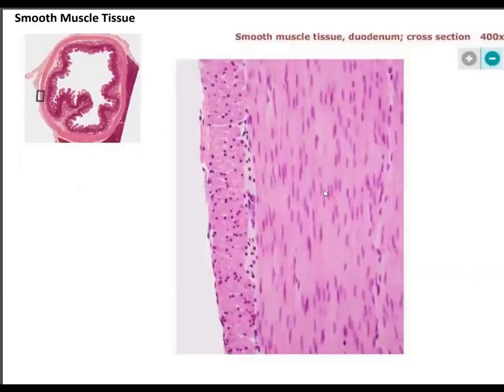This is what it looks like underneath the scope. You'll notice that smooth muscle almost always is seen a little bit out of focus. It's like it never can get fully focused. So if it looks a little hazy and out of focus, that'll clue you into this being smooth muscle. So the big tissue category here is muscle tissue, and the specific tissue is smooth muscle. So there are only 3 within your muscle tissue big tissue category.